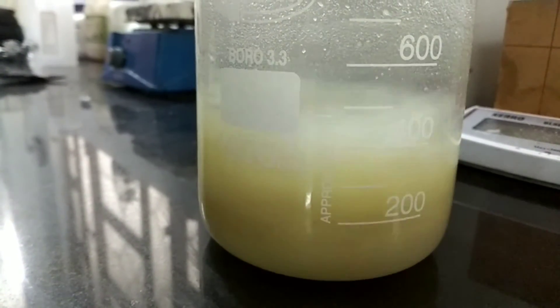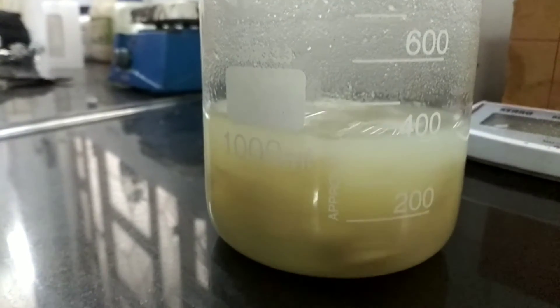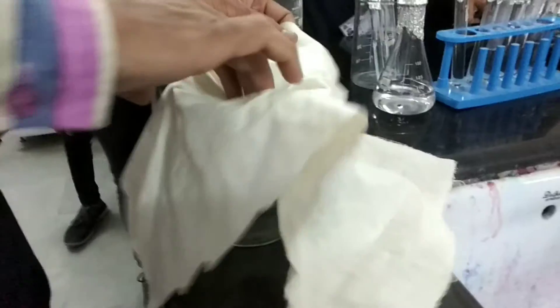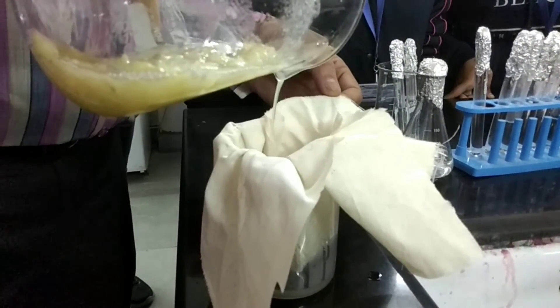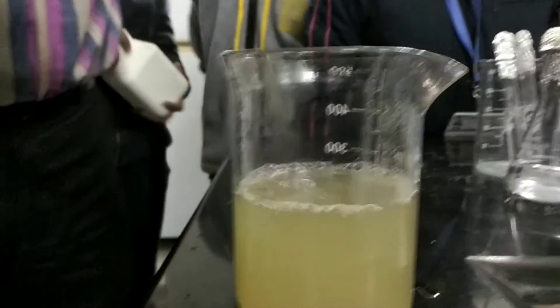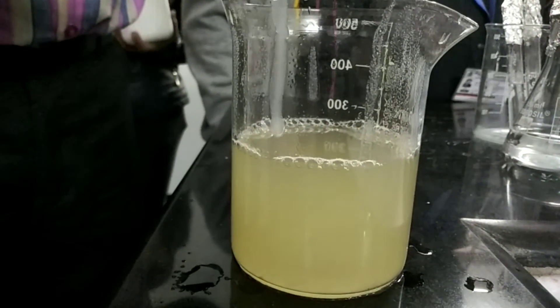After 30 minutes, the potatoes are boiled and mixing with the water to make a solution. Take the beaker off the hot plate and let it cool to room temperature. After cooling, filter the solution through a clean cloth. Squeeze the cloth so that all the remaining solution comes out. The filtered solution is the potato infusion.